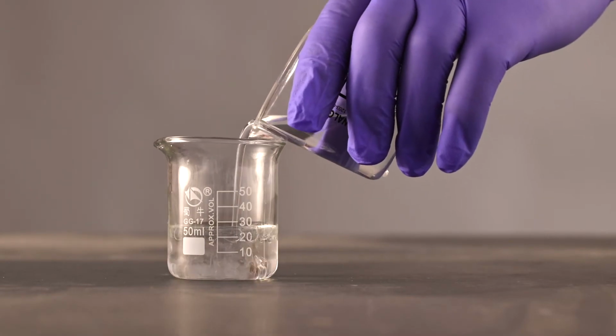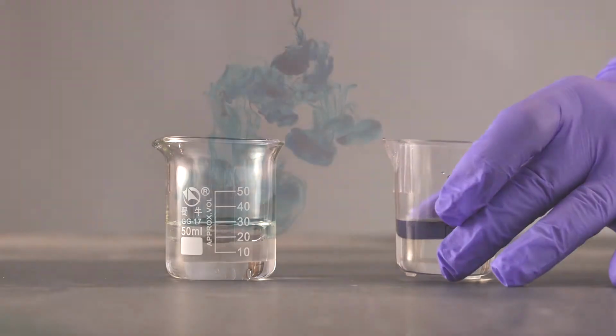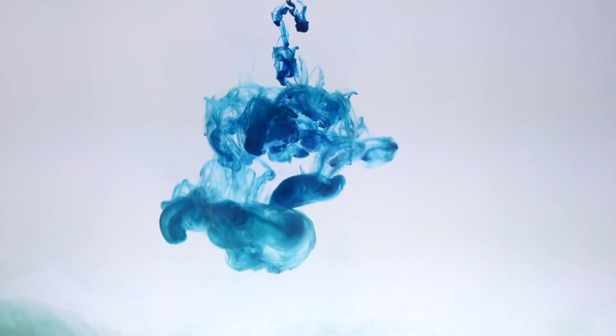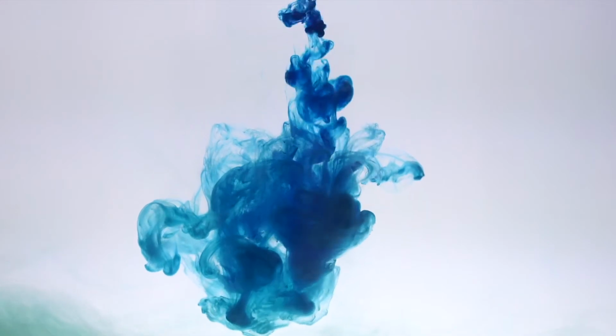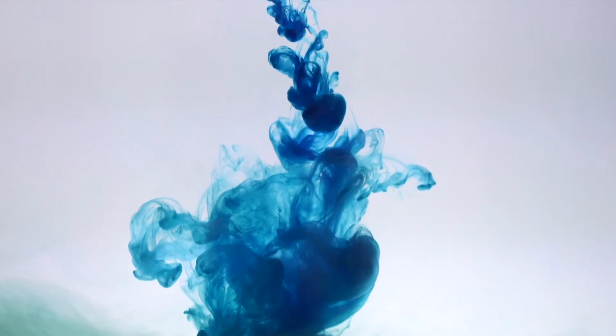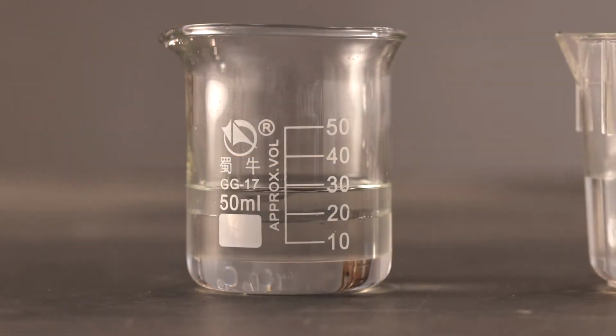Effect of water on performing an acid acceptance test. This is a follow-up on the training video from TechChem's acid acceptance instructional video for vapor degreasing solvents. We want to show the importance of taking the appropriate solvent sample from the vapor degreaser for the acid acceptance test that is not too contaminated with water, which will affect the results of the test.